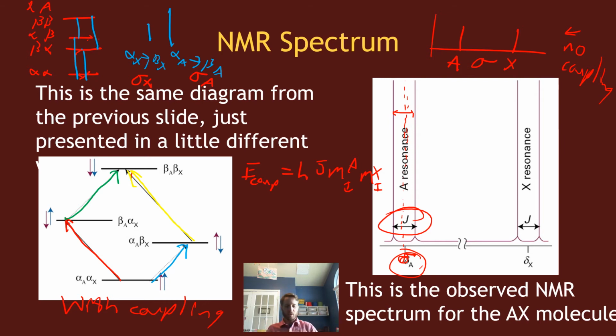So what we can measure, and all the unique information we can get from NMR spectra, and this is just for looking at chemical shifts. There are a lot of different types of NMR spectroscopy looking at a variety of things that can give us even more information about atoms and molecules based off of the nuclear spins of the atoms in your molecules.